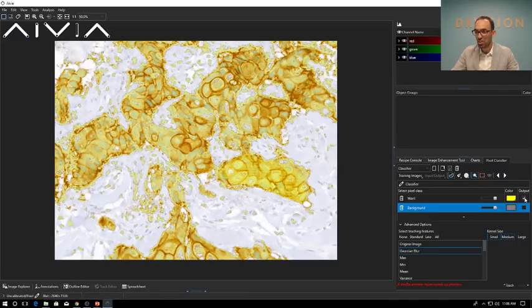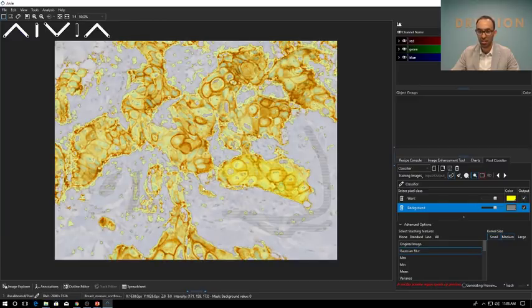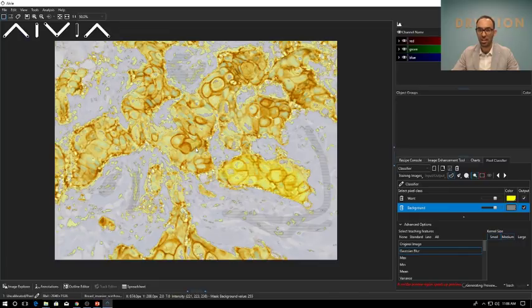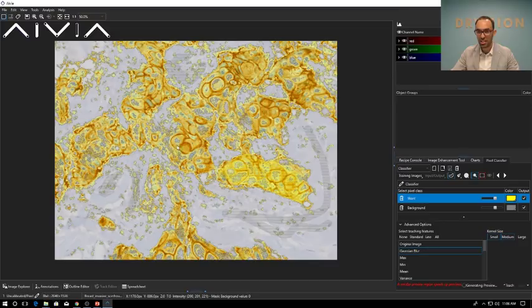That's pretty good already. You can see you can further enhance it if you continue to teach. You can get it a little bit better. And once that is done, you can also select additional features, which I haven't in this case. Once that is done, you can do the same thing you did on the other example. You can teach it and apply it.